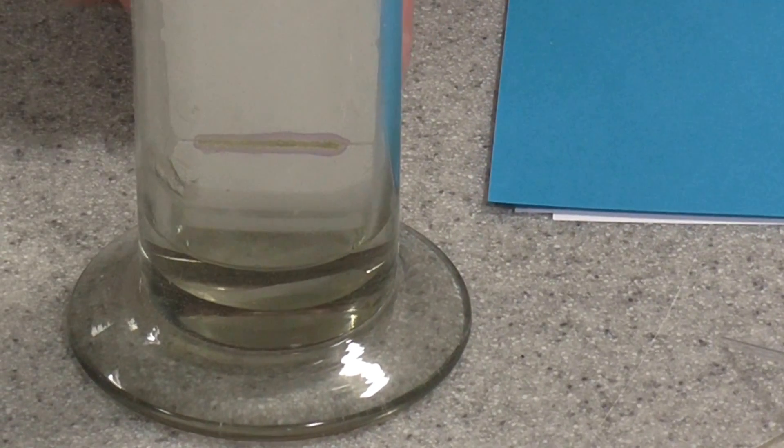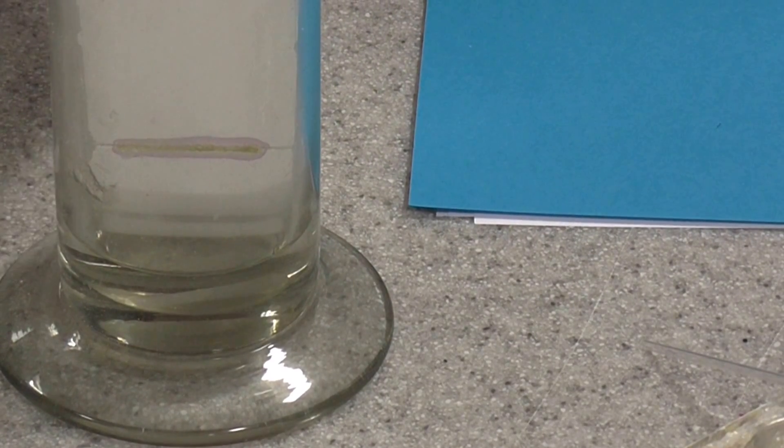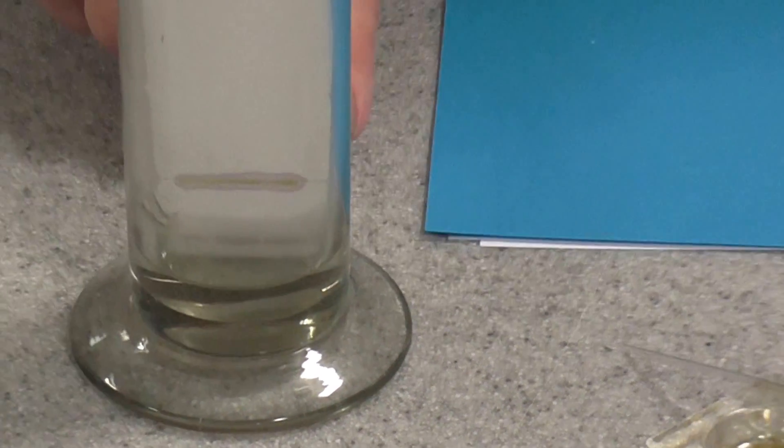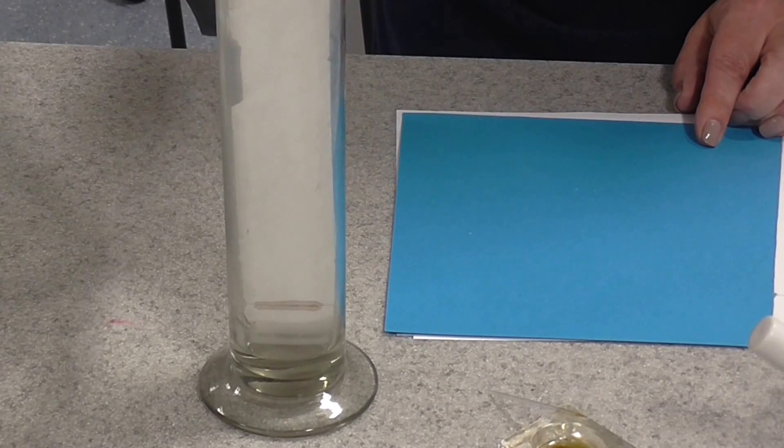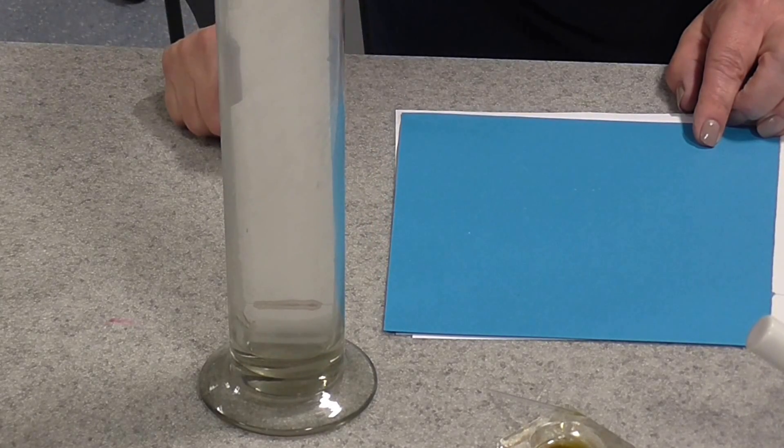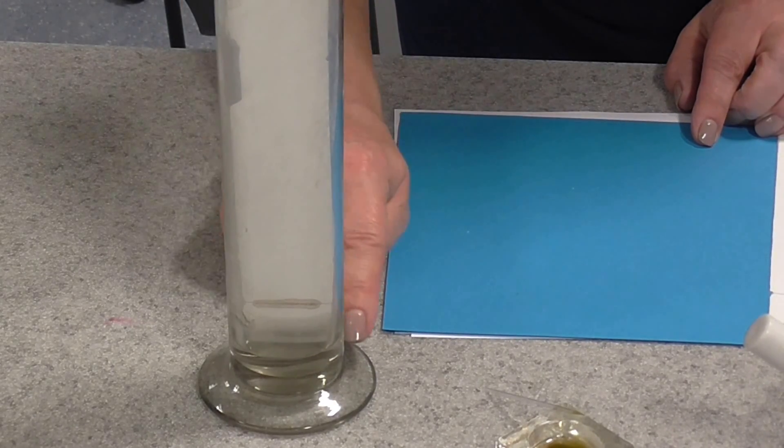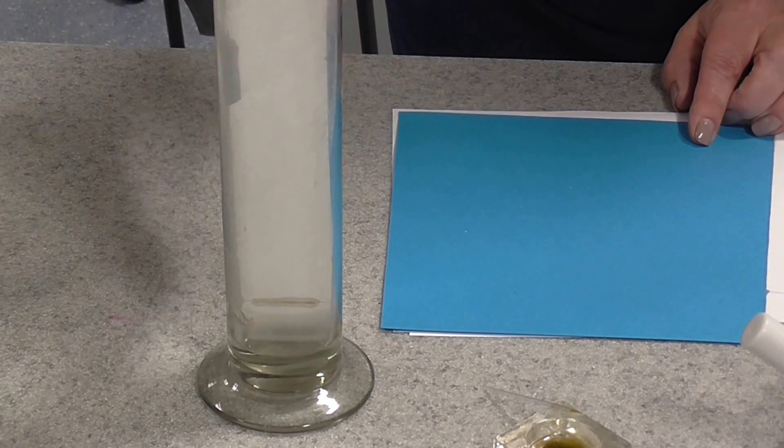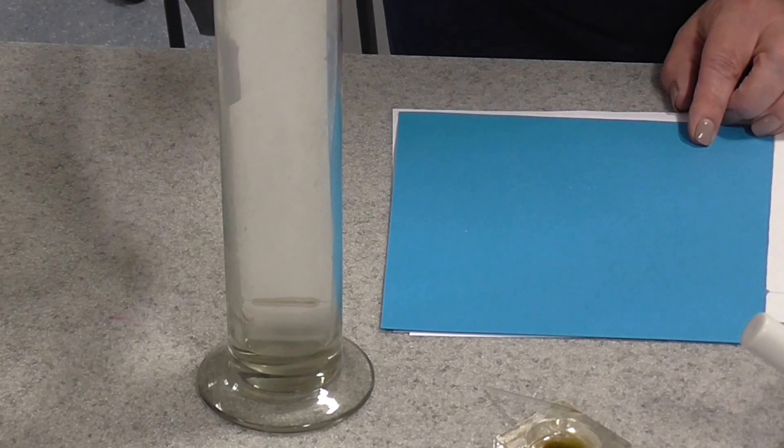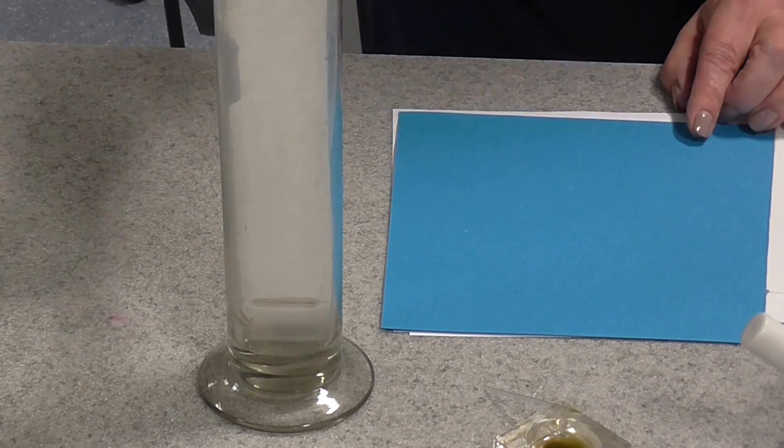And you're then going to leave that on the bench top and you're going to see the solvent slowly soak up the TLC plate and carry the pigments with it. So remember the TLC plate is what we call the stationary phase here. The mobile phase is our solvent, which is going to dissolve the pigments in the plant extract and carry them up the stationary phase, carry them up the TLC plate.